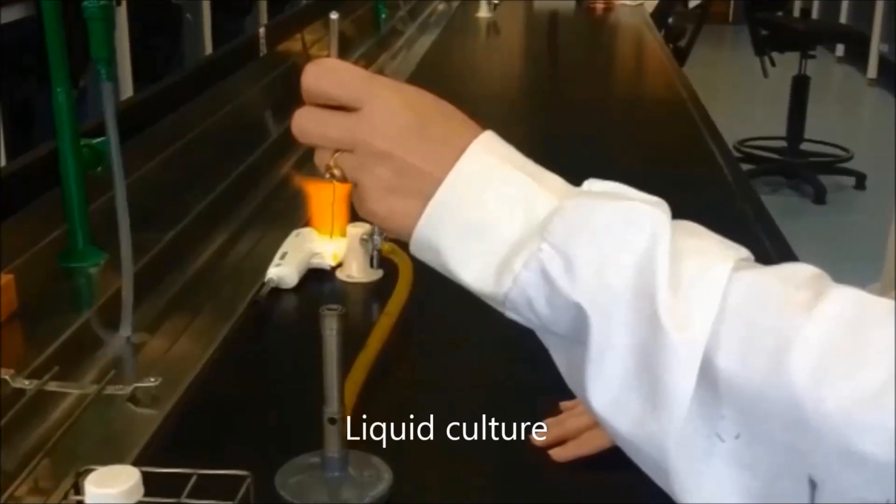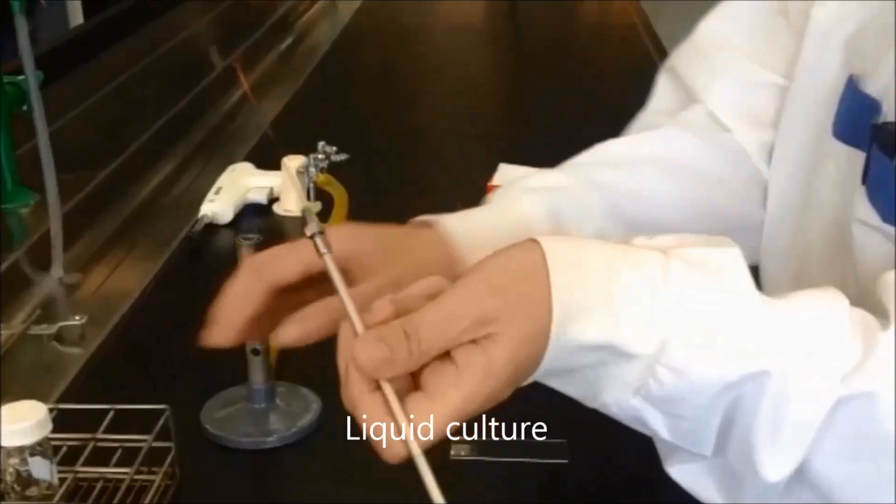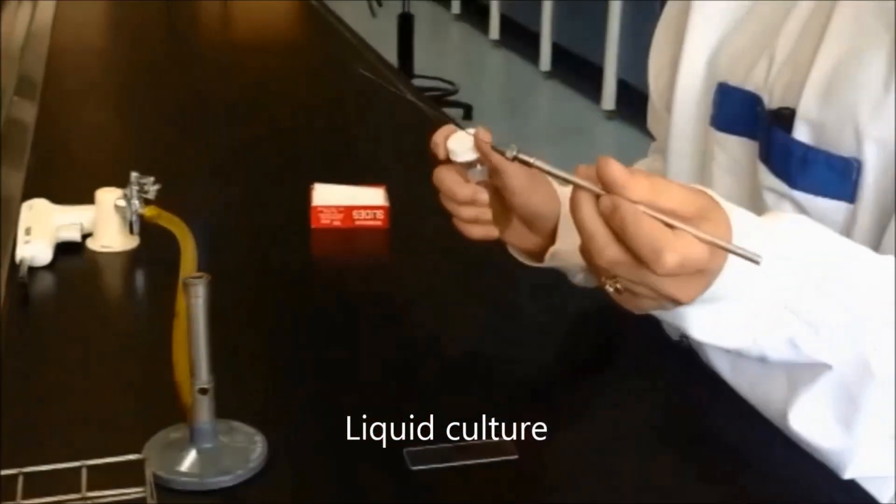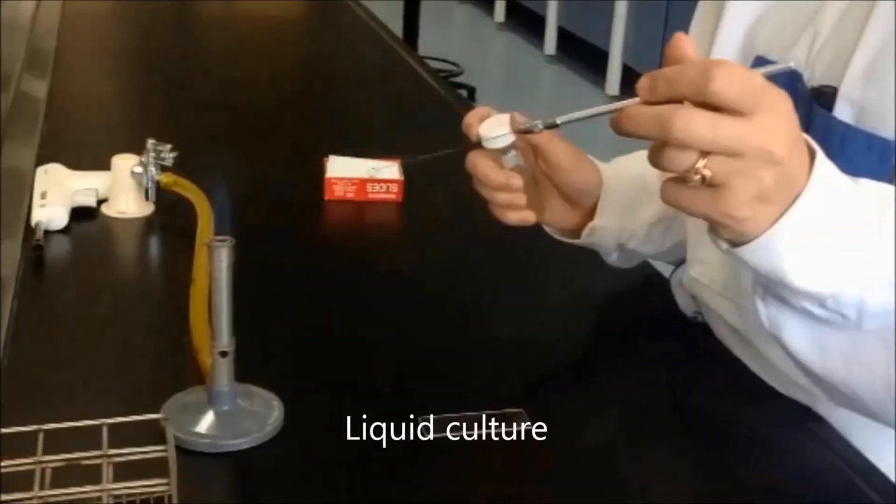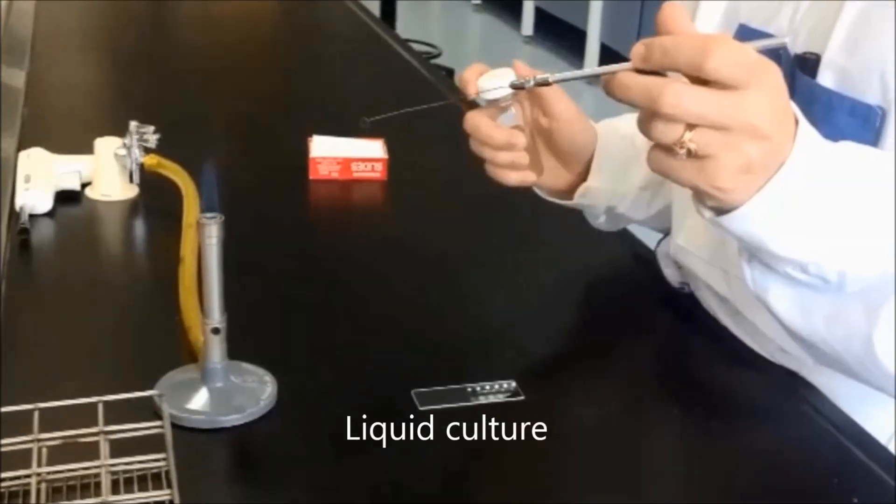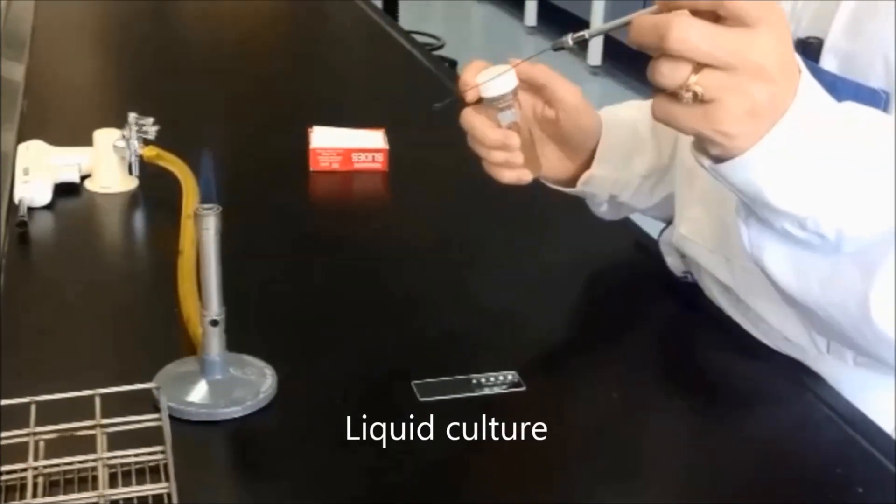Before you start Gram staining, you need to make a fixed smear of your culture on a clean slide. To make a smear of a liquid culture, for example from a broth, sterilize a metal inoculation loop by flaming.